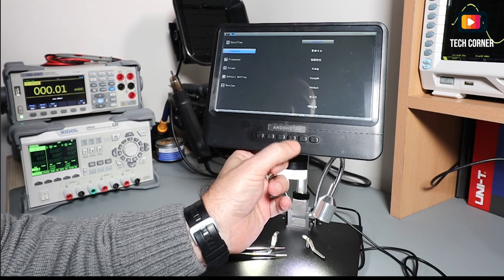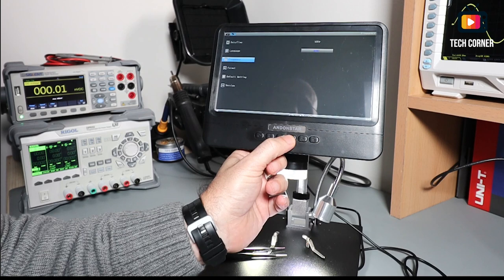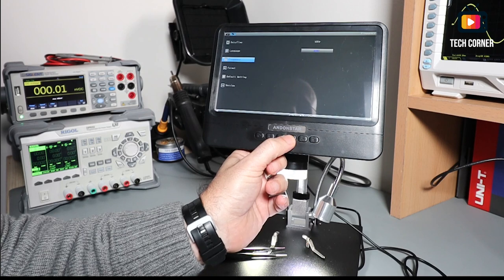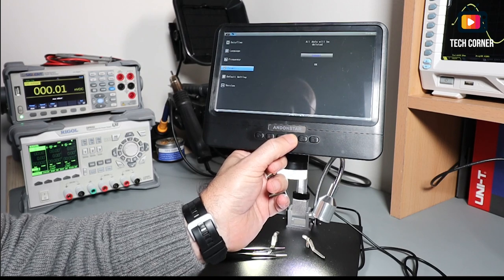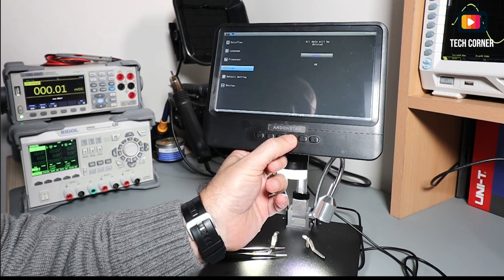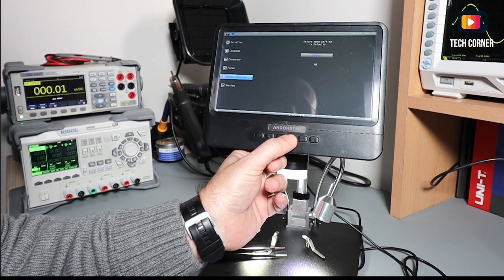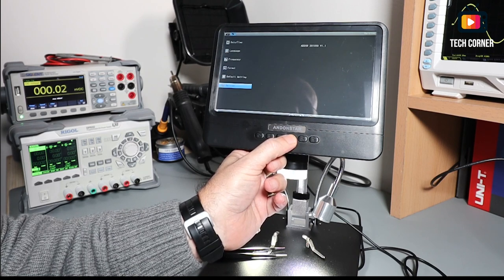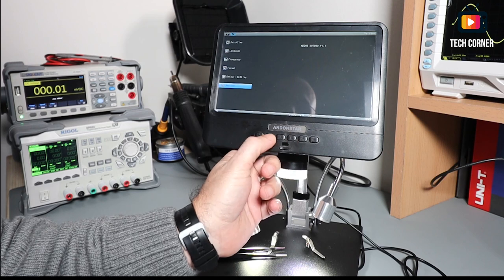We have also the frequency of the monitor, of the screen, an option to format the SD cards, factory defaults and the version of the microscope.